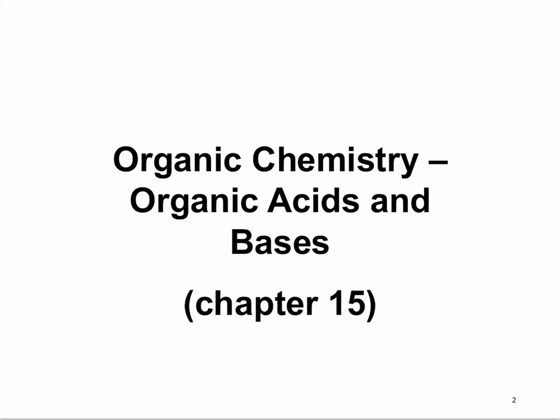I'll do a little mini lecture on what a carbohydrate is, and then the different tests you're going to be doing. So basically, you're going to be doing a bunch of reactions to determine if you have reducing sugars or not in solution. But we'll try and get through organic acids and bases first here, right?